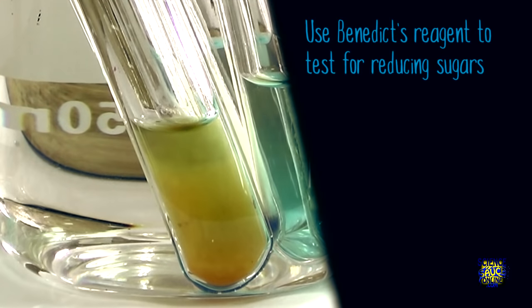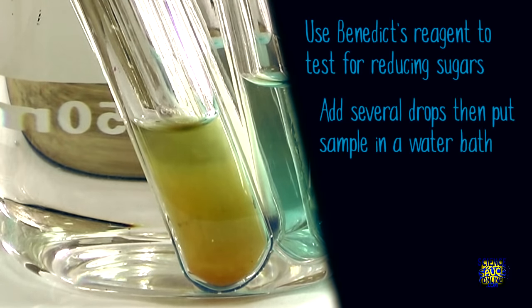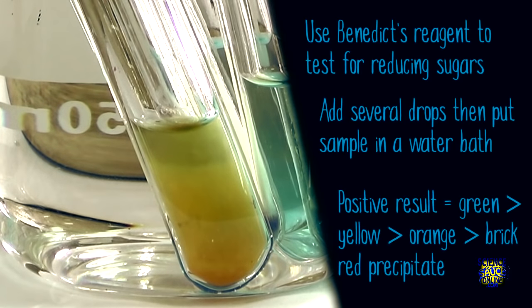So to summarize, we use Benedict's reagent to test for the presence of reducing sugars. Add several drops to your samples and then put them into a water bath. Depending on how much reducing sugar is present it'll first turn green then yellow then orange and it could form a brick red precipitate if there is a lot of sugar present.